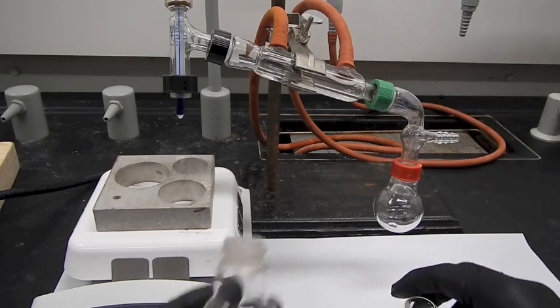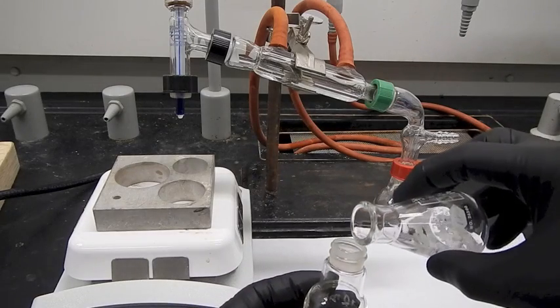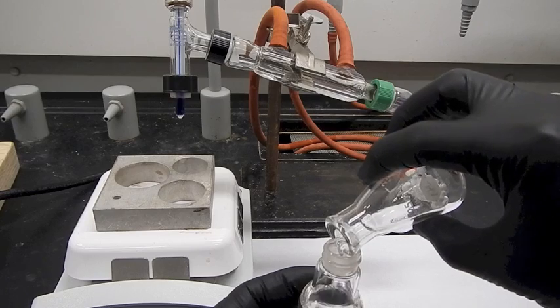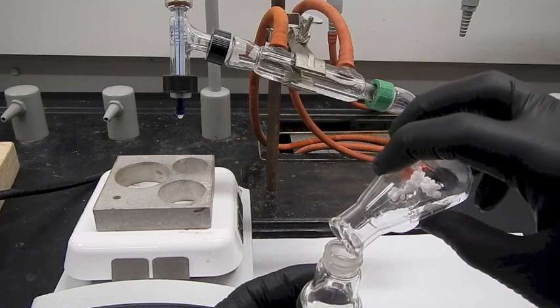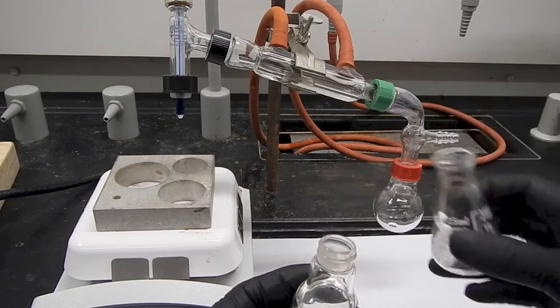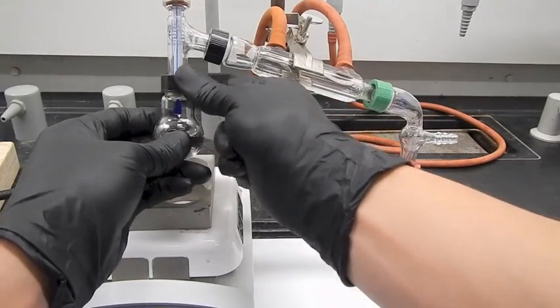And I'm going to transfer this into a 10 milliliter round bottom flask that I've got boiling stones in. And again, I'm just decanting here to get it into that 10 milliliter round bottom flask. I want to leave behind all that drying agent, so if you want to use a Pasteur pipette, that works just as well. And hook this up to my distillation setup.